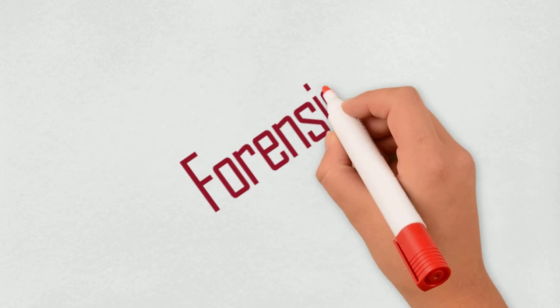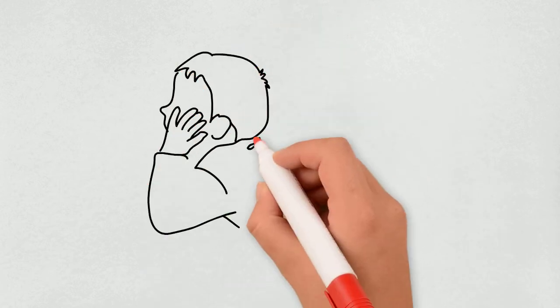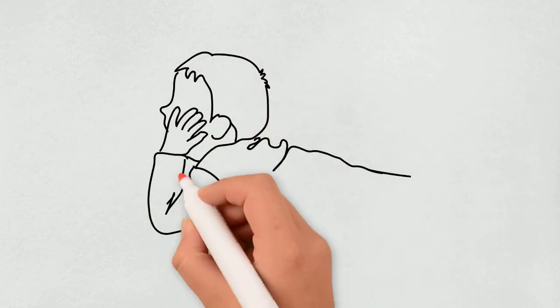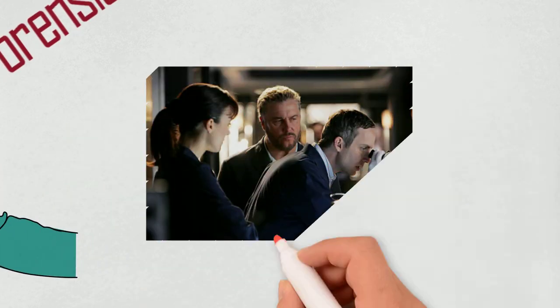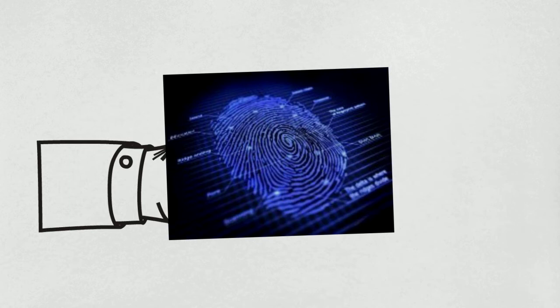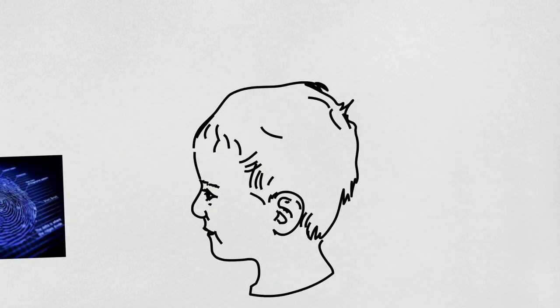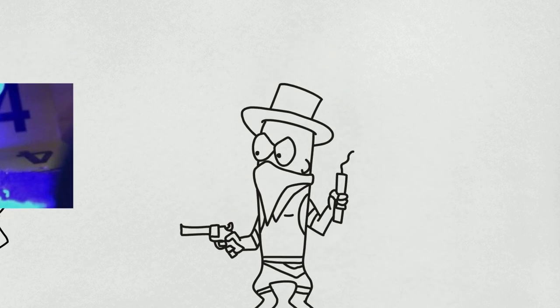Another field is forensics. Forensic microscopy is the most important technique used in forensic science to examine physical evidence, as made public by crime shows such as CSI and other forensic shows. Forensic microscopy includes the identification and classification of a wide range of materials and substances, impressions such as fingerprints, trace evidence such as hairs and fibers, fractured fragments such as broken tools, genetic markers, bullets, and handwriting.